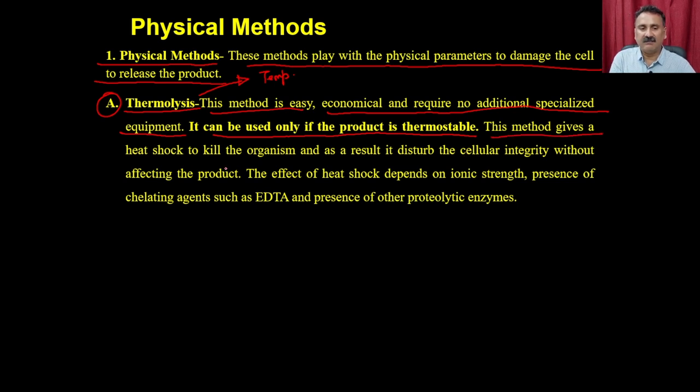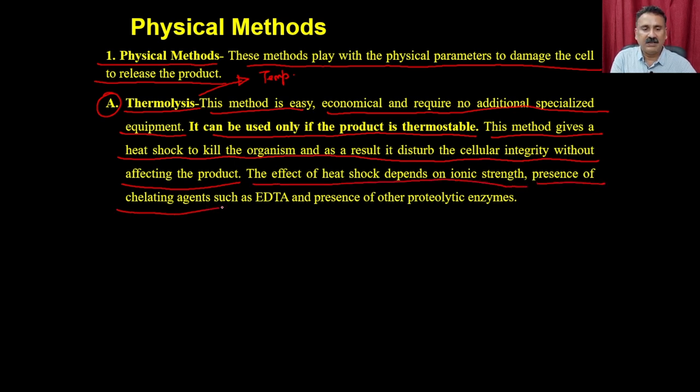This method gives a heat shock to kill the organism, and as a result, it disturbs the cellular integrity without affecting the product. The effect of heat shock depends on the ionic strength, the presence of a chelating agent such as EDTA, and the presence of other proteolytic enzymes.